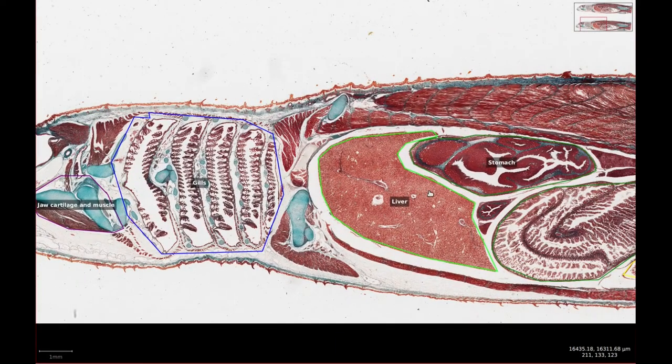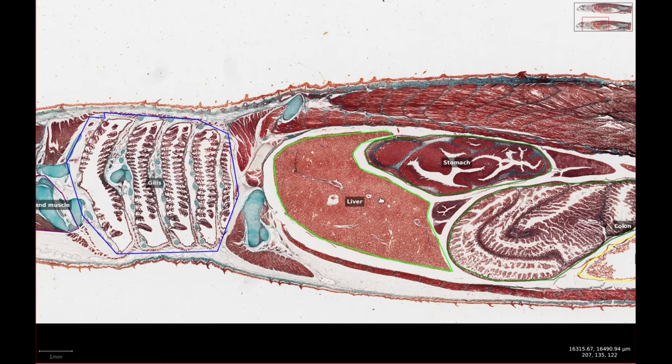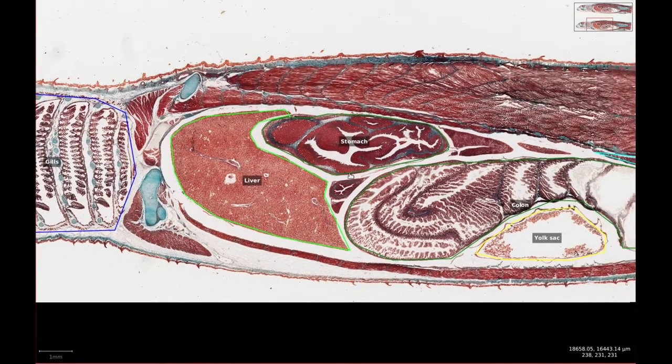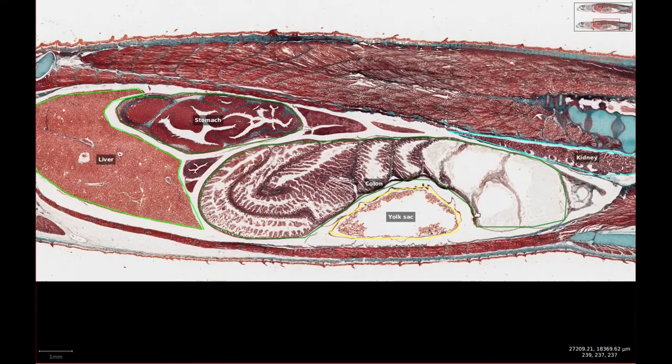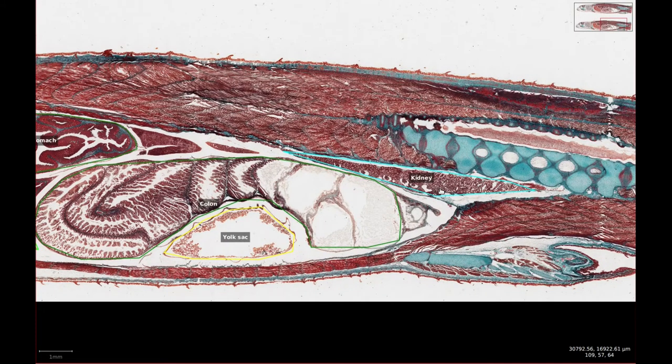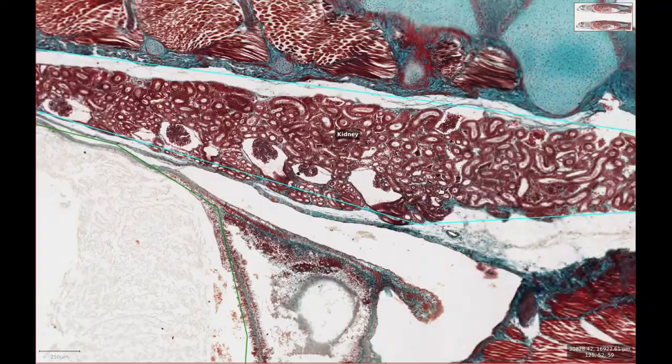Within the coelomic cavity there are good sections of liver, stomach, and colon with a much smaller portion of the yolk sac. Again there's a small section of kidney adhered to the dorsal body wall.